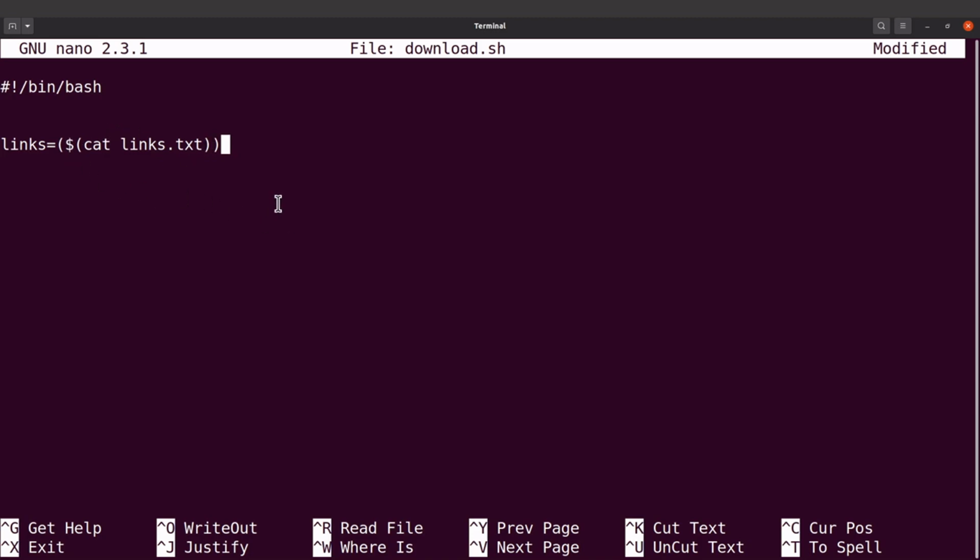Arrays act as containers that can be used to store data. I'm using the word container here, it's not really scientific, but I'm using it so that beginners can have an idea. Arrays are a data type used to store data, but it's more like a container in layman's terms. So that's what this one and then this one are going to do for us.